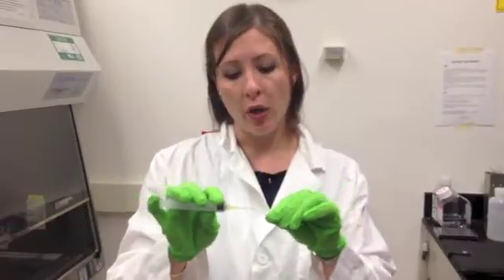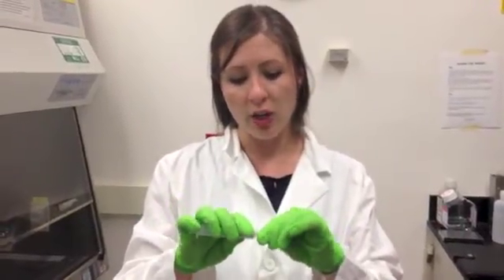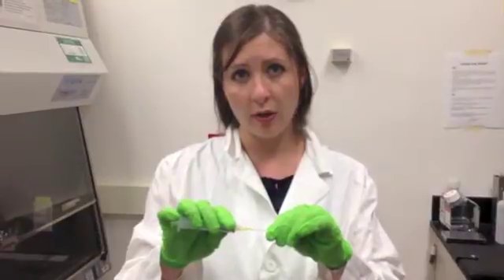There's something that we call recoil, which is where when you take the needle cap off, you can see my hand kind of bounce back toward the other hand a little bit. And that's a great prime opportunity for the needle to actually poke you. So you want to be very gentle about removing the needle.